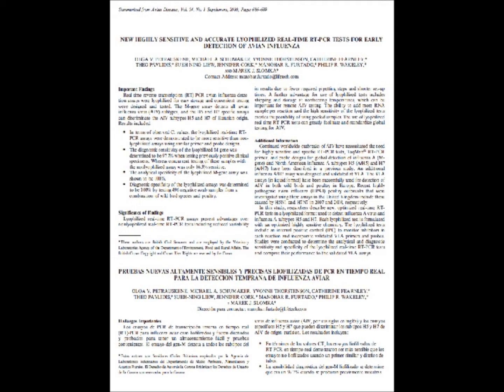That's one advantage. The second advantage is because of the low water content, you don't get contaminating bacteria or other organisms growing within the reaction itself. So there are definite advantages in terms of stability and ease of use when it comes to using lyophilized reactions. The other thing I should mention is the ease of use. Because you have all the components lyophilized in one pellet, you don't need to mix 3 or 4 reagents when you set up a reaction, and that's typically useful in a routine testing lab.